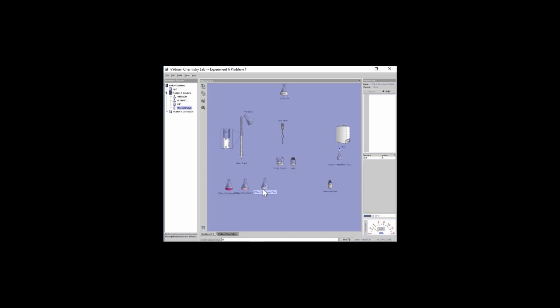Now for my third trial, I'm going to take this one here. Again, I was confident. First trial, 10 was overshot. 9.77 seemed to be good. I can even transfer in 8 really quickly. You can save time. Pour in 8, right? Did that go in? No, not yet. So pour in 8, and therefore, it hasn't overshot yet.